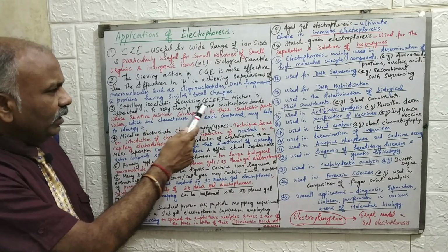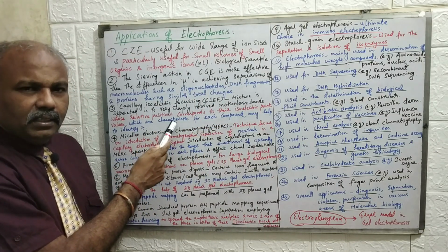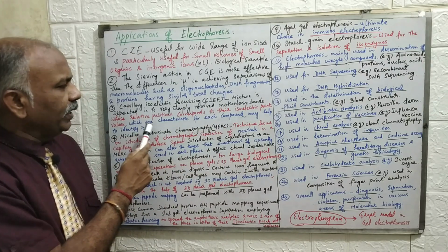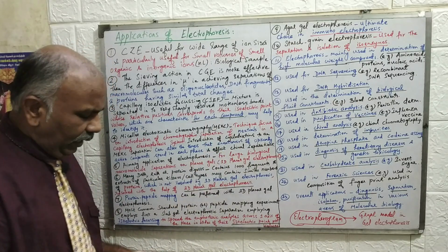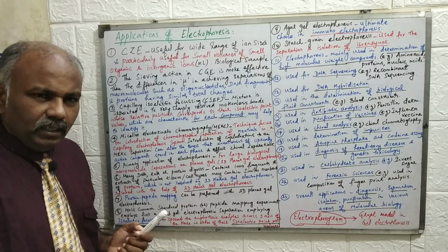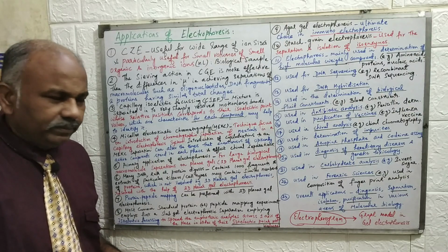So what happens is the mixture is separated into very sharply resolved motionless bands whose relative positions correspond to their isoelectric point values, which are characteristic for each compound and may help to identify it. So for every compound the isoelectric point is very characteristic. Based upon this particular technique of electrophoresis, the name of the technique is capillary isoelectric focusing, or CIEF. Using this technique we can identify a particular amino acid at its specific isoelectric point.